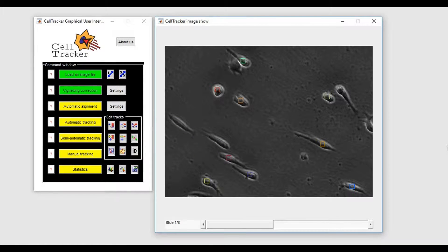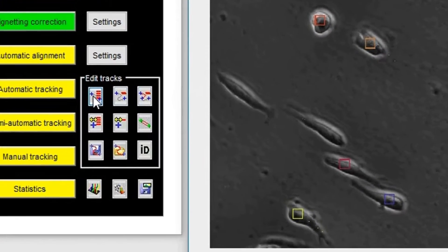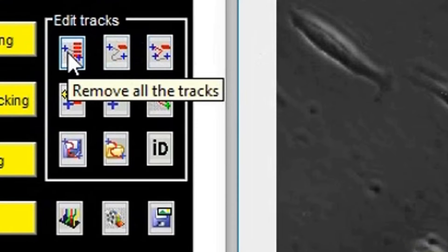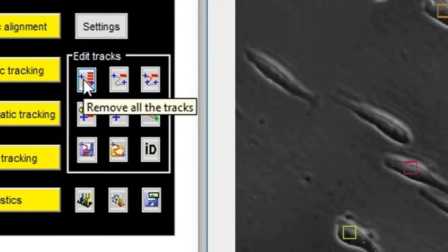If you are not satisfied with the obtained tracks, you can delete all tracks simply by using the Remove All Tracks button.